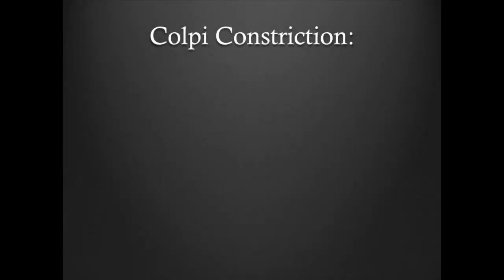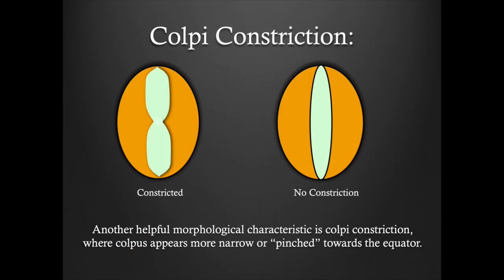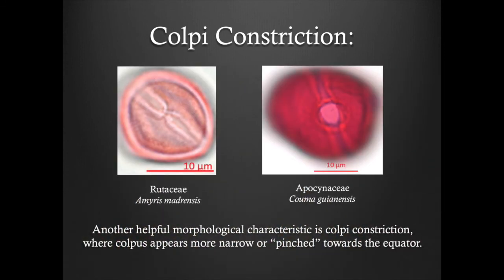Colpi constriction. Another helpful morphological characteristic is colpi constriction, where the colpis appears more narrow or pinched towards the equator. Here is an example of a constricted grain compared to a grain with no constriction.